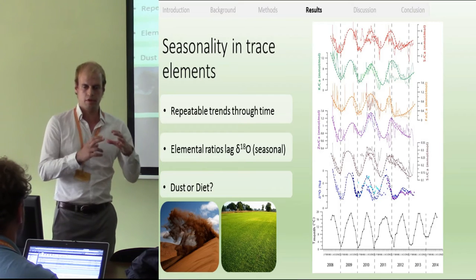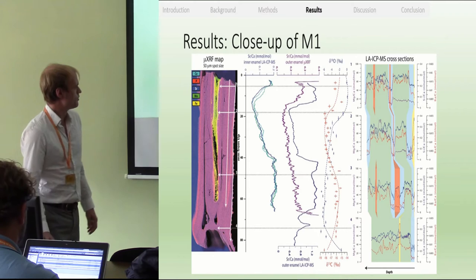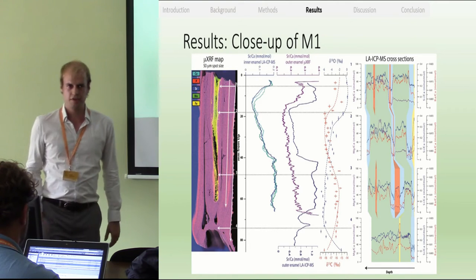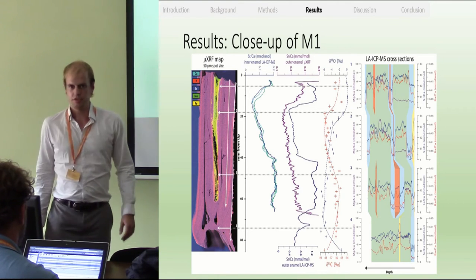We went into a little bit more in-depth research and took one of the teeth, mapped it using micro-XRF, did microscopy on it, and identified different phases in the tooth. And then we used another method for trace element analysis, which is shown again.